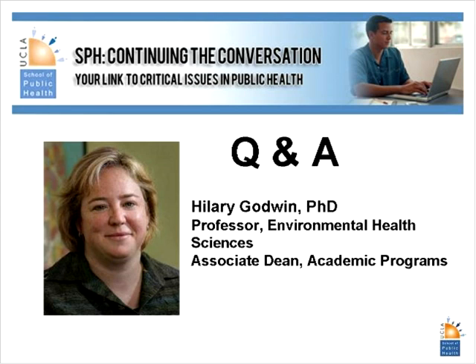I gave the one example of doing swarm analysis within HIV, but another area that's important to a number of people at UCLA is that we have another high throughput screening laboratory on campus that can handle up to BSL-2 agents that's used extensively by researchers across campus for translational research, to screen, for instance, for new therapeutic agents to target specific infectious diseases. And there's been so much success with that facility that there's a big push for us to expand that capability into handling more virulent pathogens, which would be enabled through this facility. So that's another area where there's a huge demand, and it again is a fairly unique combination of having the automated systems within a high-level containment facility.